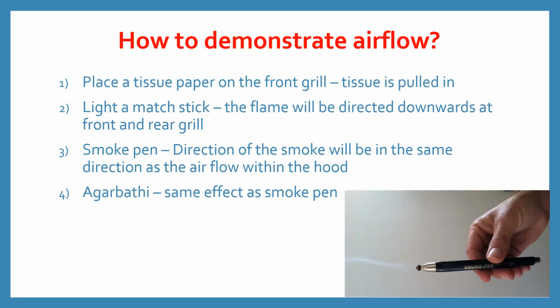How to demonstrate airflow in a biosafety cabinet. There are different methods to do so. A few examples are listed here. 1. Place a tissue paper on the front grill. The tissue is pulled in.